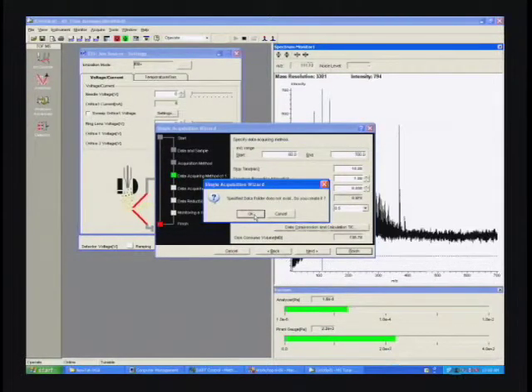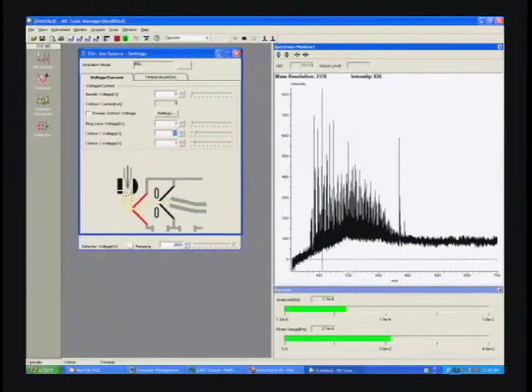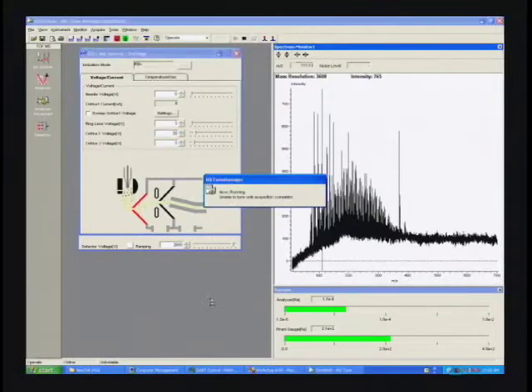I created a new folder for today's data, so it's reminding me that we need to create that folder. Now, I'm going to have it show us a real-time spectrum acquisition and a real-time chromatogram or time profile for the ion current. So the program is going to open up both of those windows, and we'll wait for the start button. As soon as the start button shows, we'll begin collecting data.